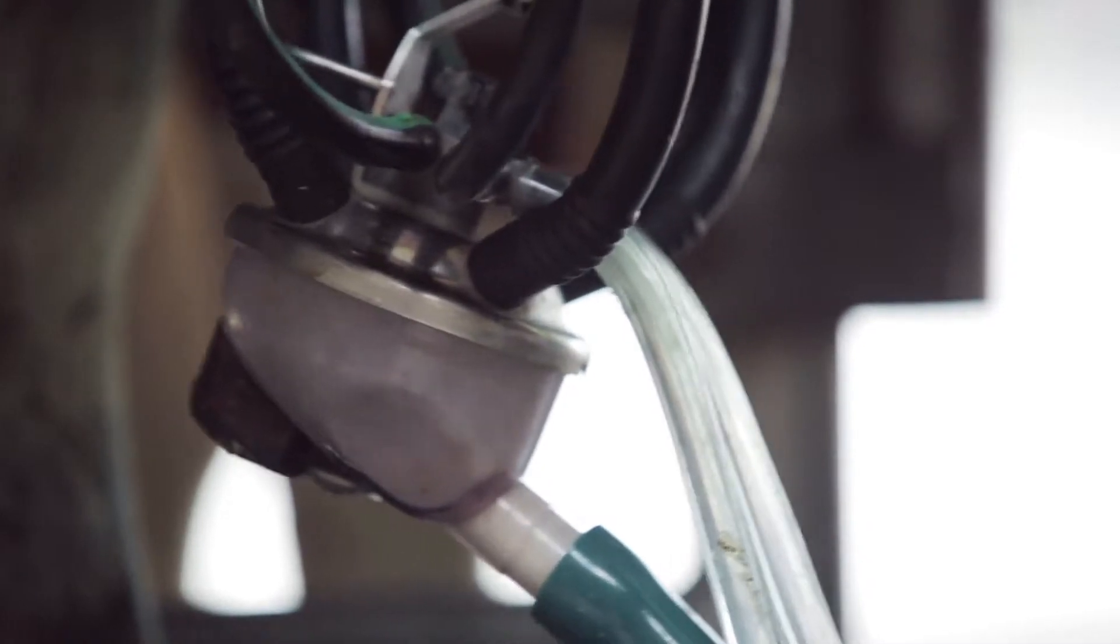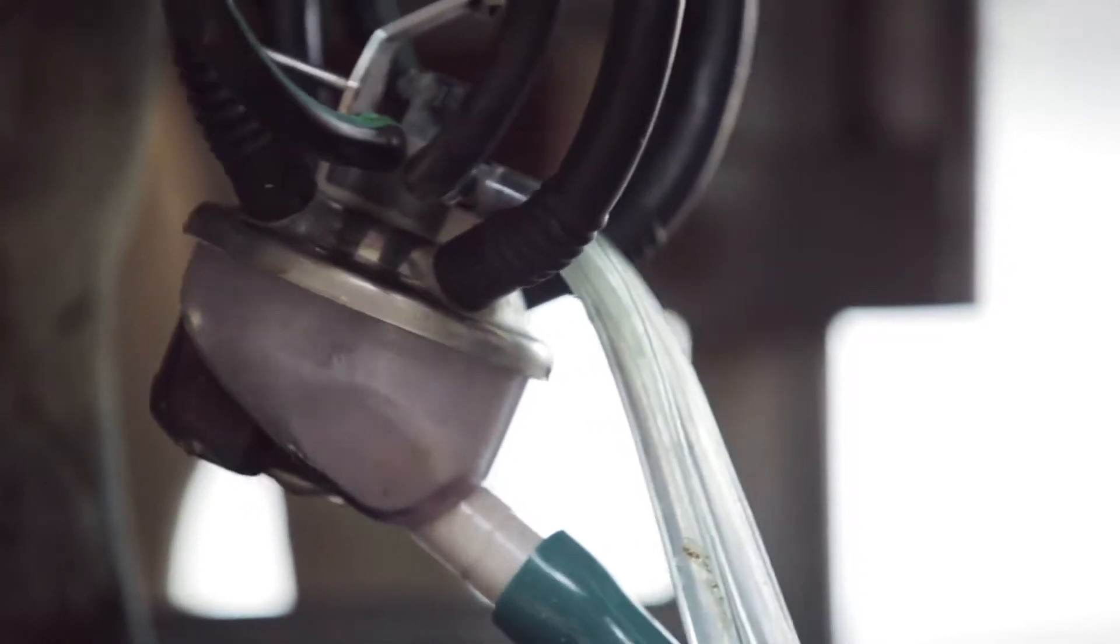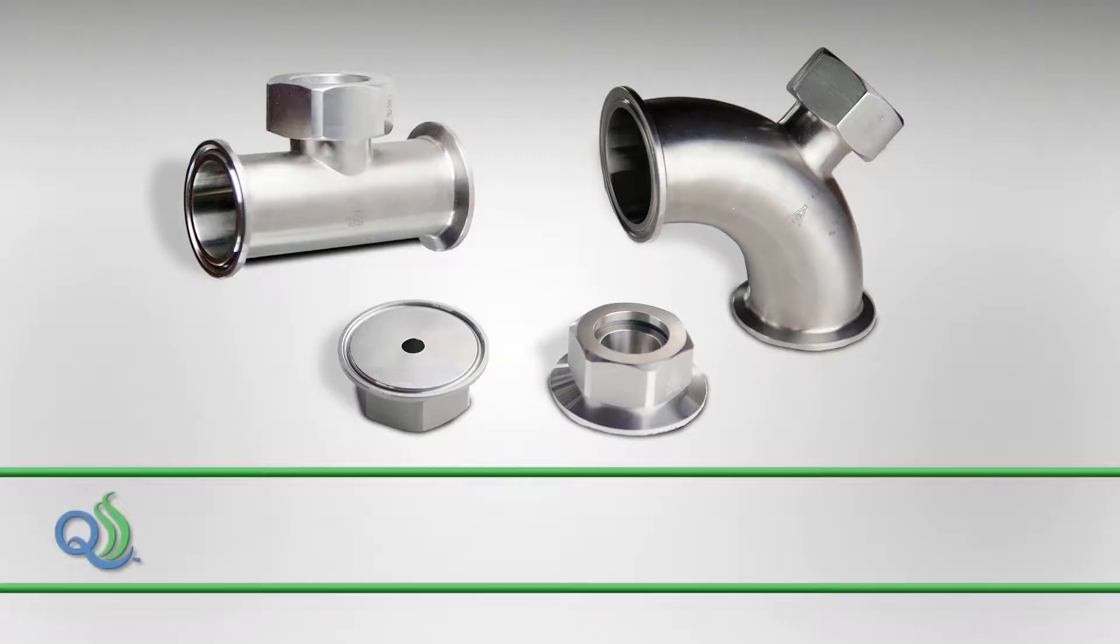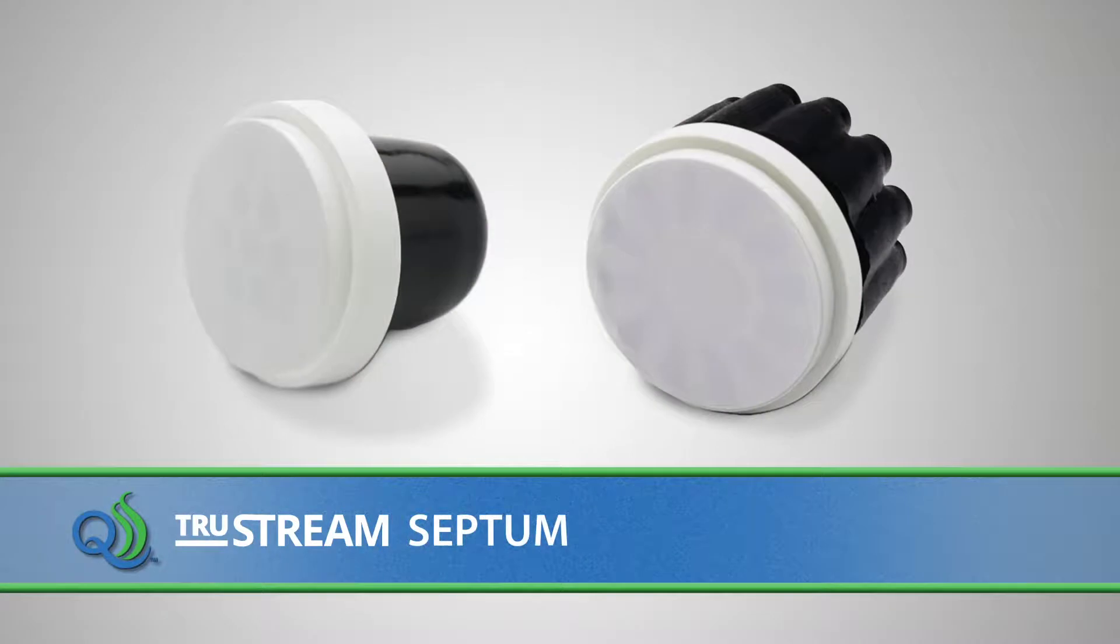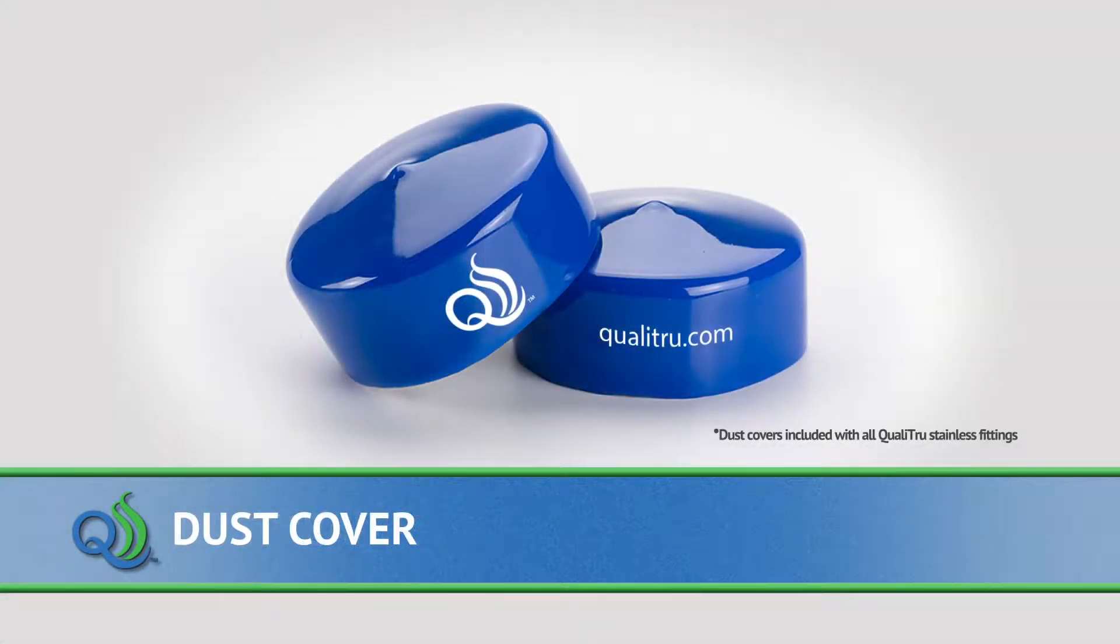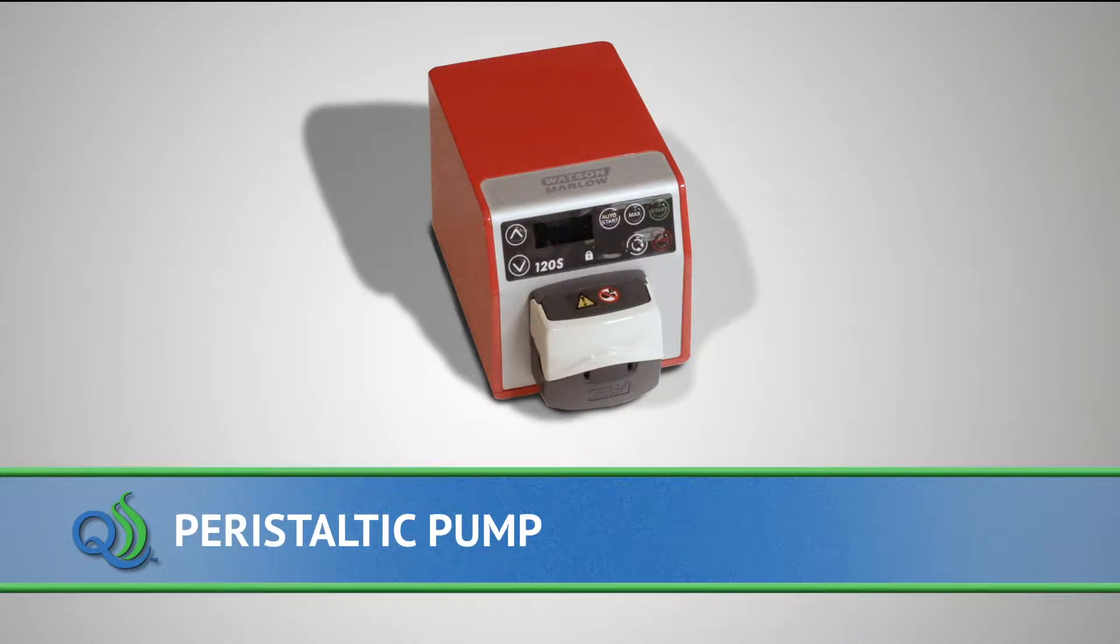The items needed for the QualiTrue In-Line Direct Load Sampling System include a TruStream 7 or TruStream 12 stainless steel port, a 7 or 12 channel QualiTrue sterile septum, and a blue dust cover.